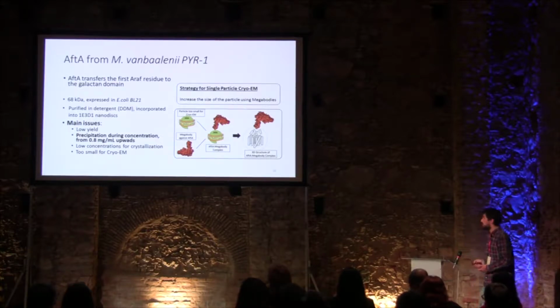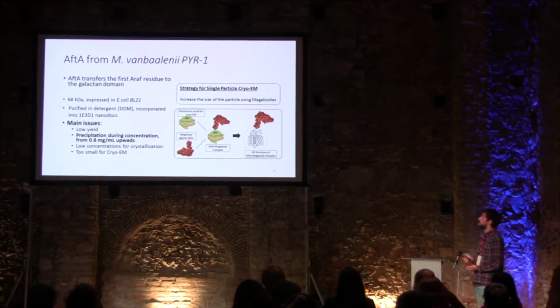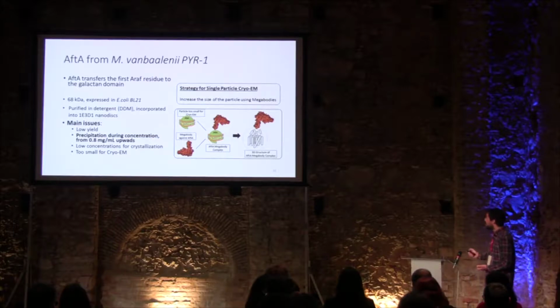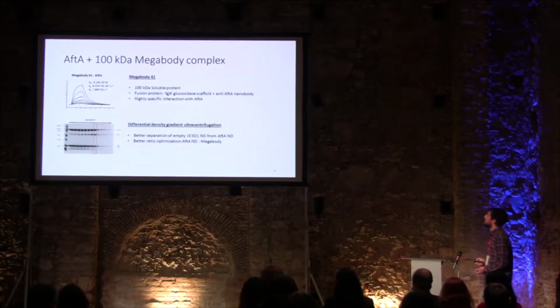So through the Instruct Center in Brussels, we went there to discover nanobodies against this protein, and the strategy for single particle cryo-EM is to increase the size of the particle using first nanobodies and then upgrade the nanobody to megabody, and hopefully get a protein complex, and we solve the complex altogether with single particle cryo-EM.